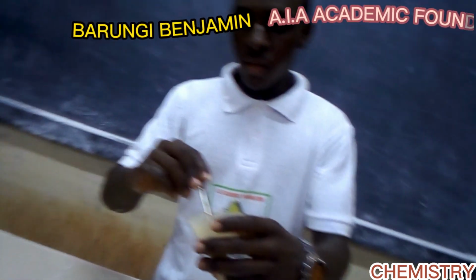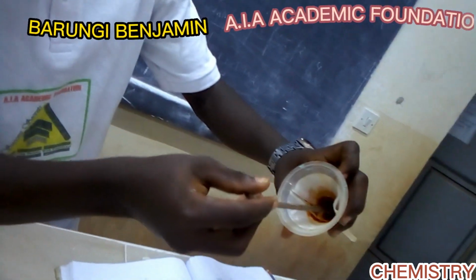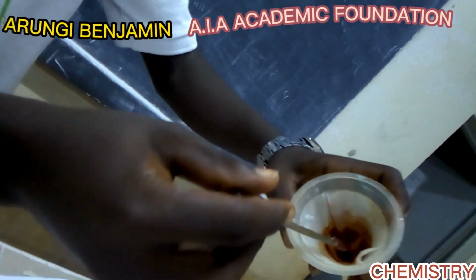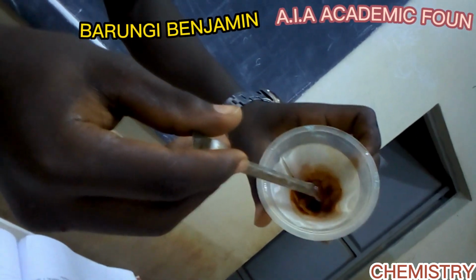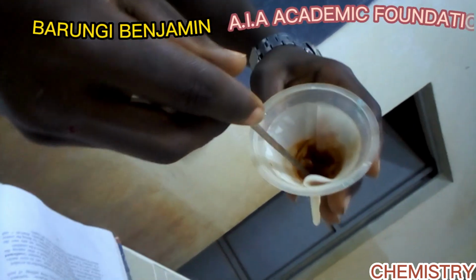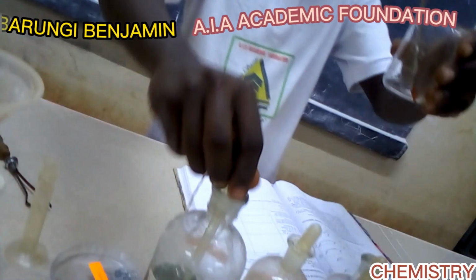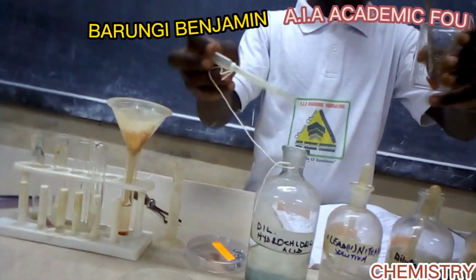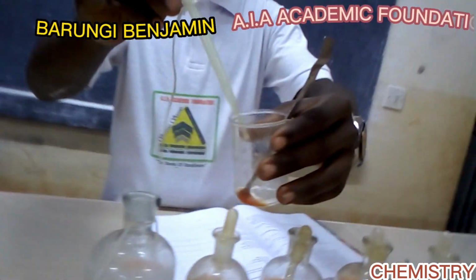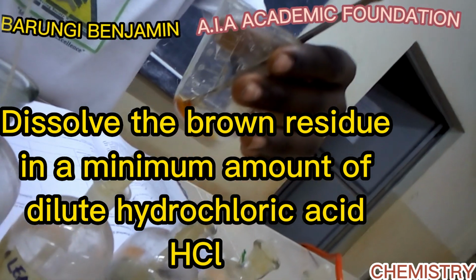So we are going to get it out of the filter funnel that way. Dilute hydrochloric acid. I said we dissolve it in a minimum amount.